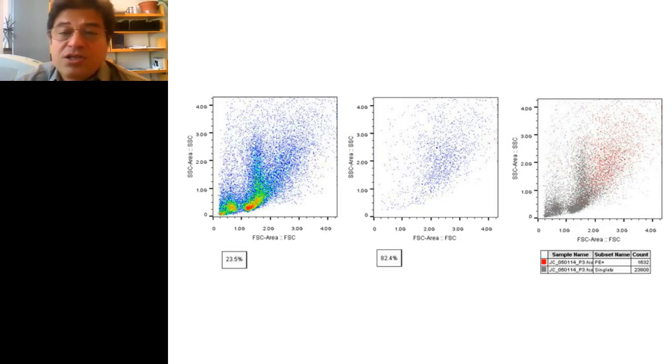This is an illustration of a potential problem. This is not an elutriation result that we're showing here at the moment. But basically, the question is, can you get these cells out, which are here, but with minimizing the amount of this small contamination from small material that comes along? So we see the elutriator as a good first step to cleaning this up.